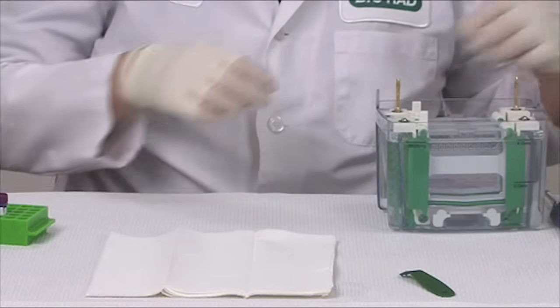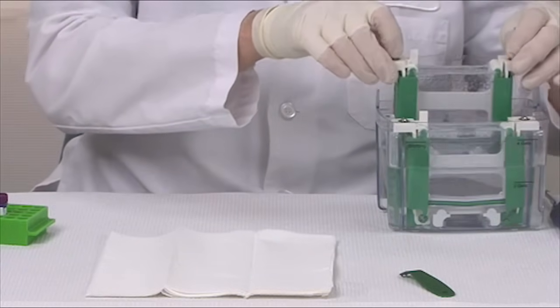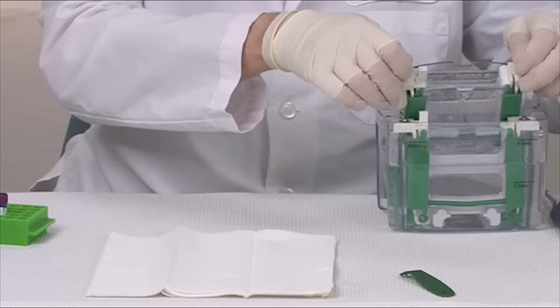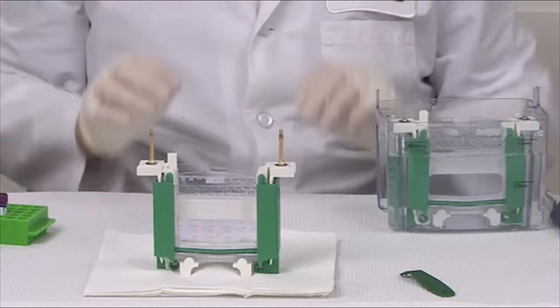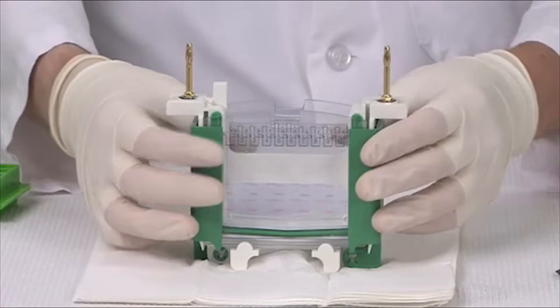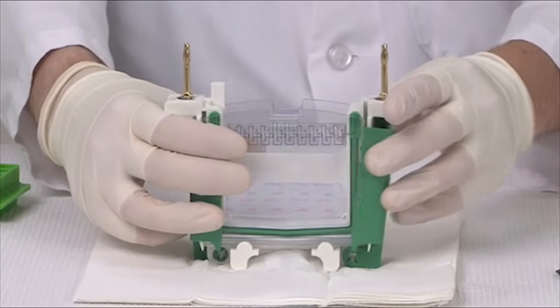Pour the buffer out of the core so that you can unload the gels. Now you are ready to remove the gels from the core assembly. Open each wing clamp of the core and remove the gels.